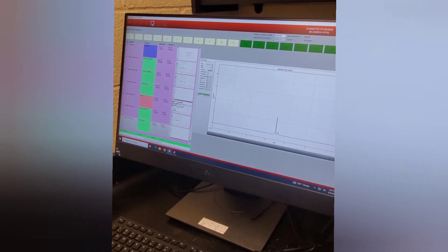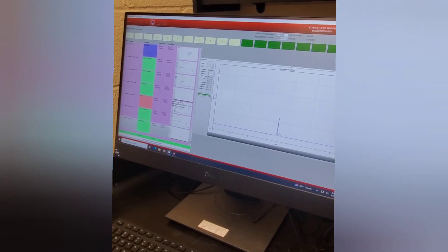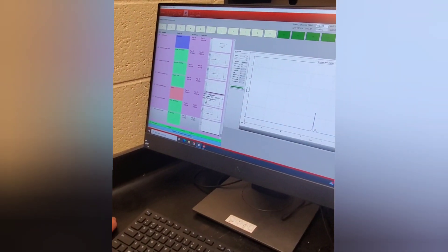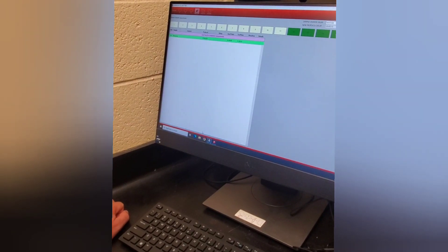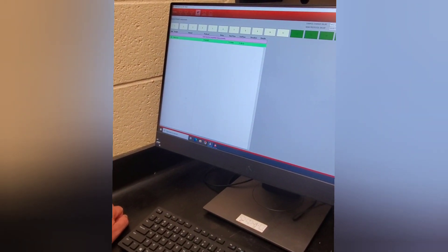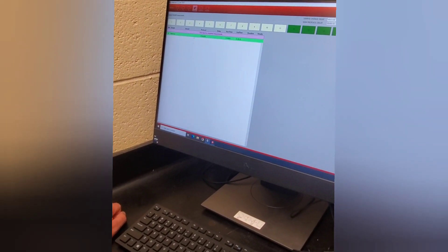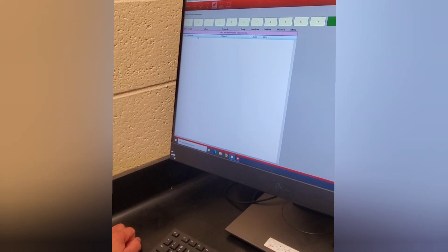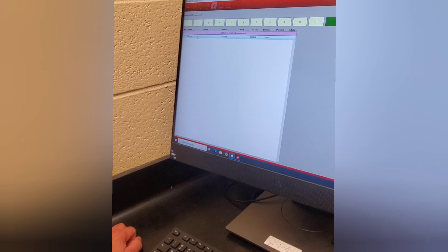We want to make sure that we are in the queue section. Once we're in the queue we can click on the cued measurement — these are the measurements that are queued and ready to go. Right now we only have one thing in the cued measurement, and this would be normal: that's the reference tube which just contains water, so we're locking to the NMR signal of water.